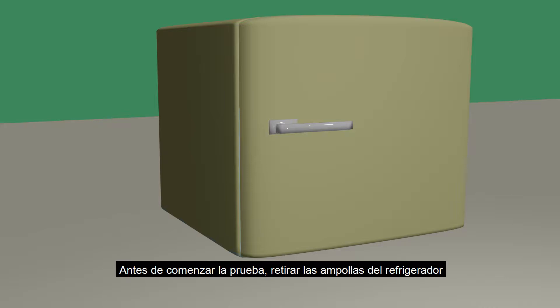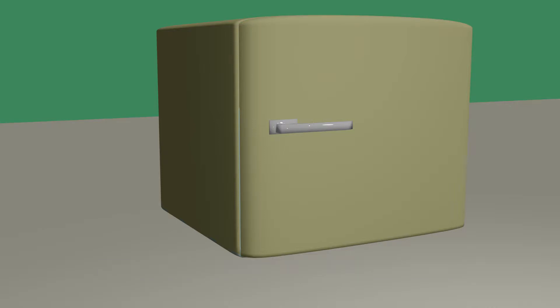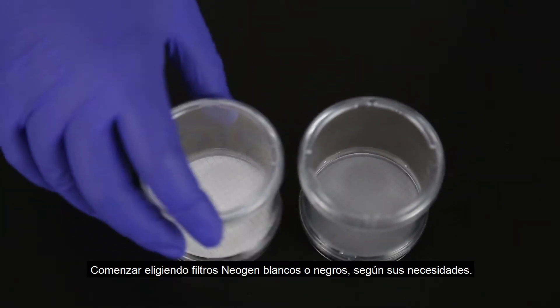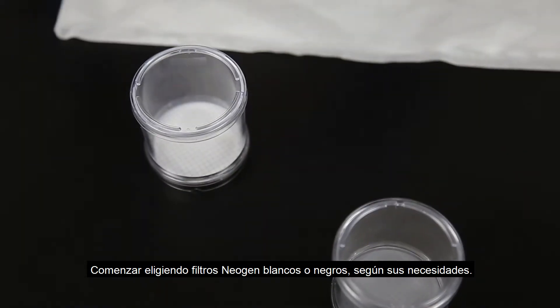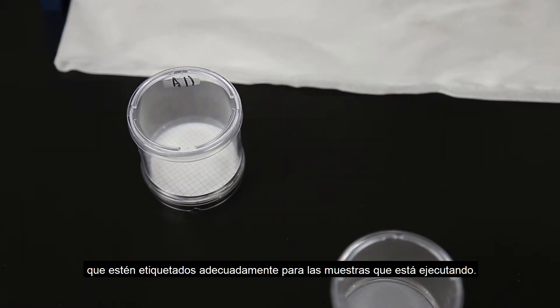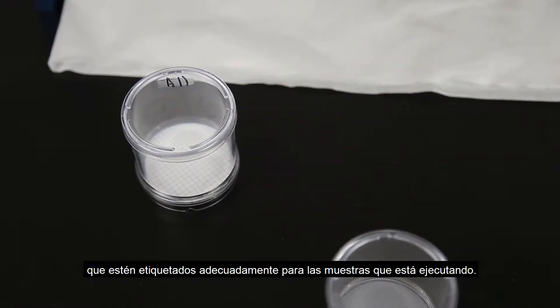Prior to beginning the test, remove your ampules from the refrigerator to allow them sufficient time to reach room temperature. This takes approximately 30 minutes. Begin by choosing either white or black Neogen filters depending on your need. This would also be a good time to make sure they are labeled appropriately for the samples you are running.